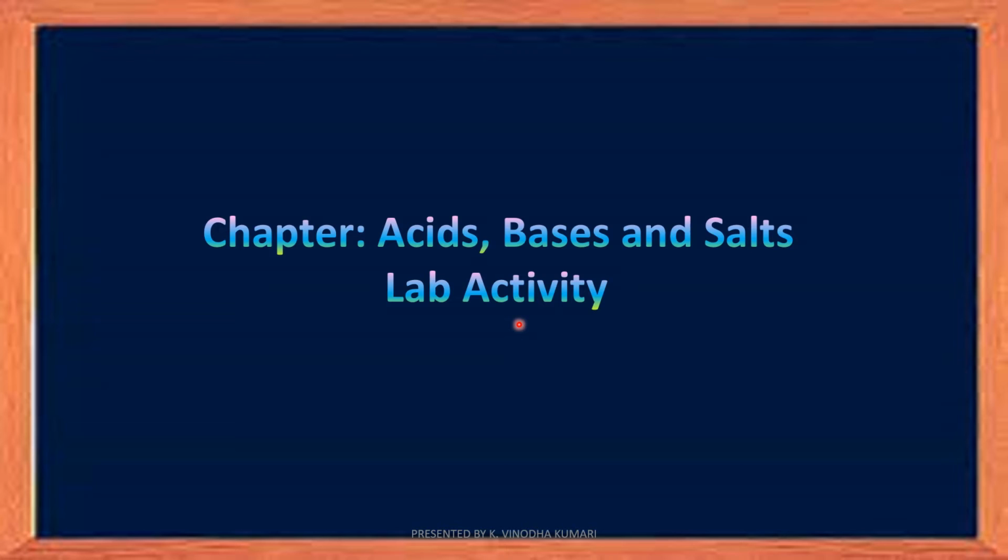So today in this video, let us perform an activity to know whether all compounds containing hydrogen are acids or not. Okay, so we'll do an activity and we'll make a conclusion.